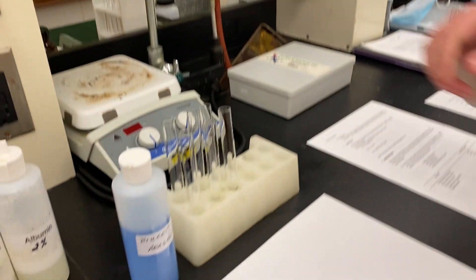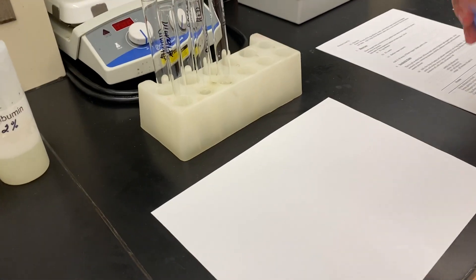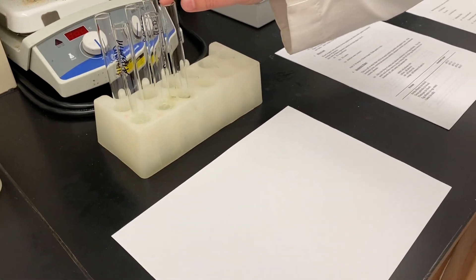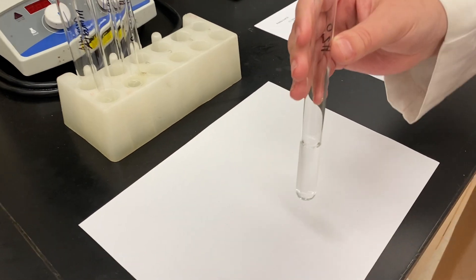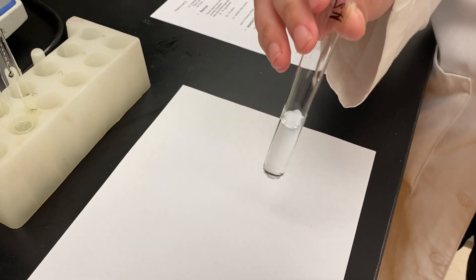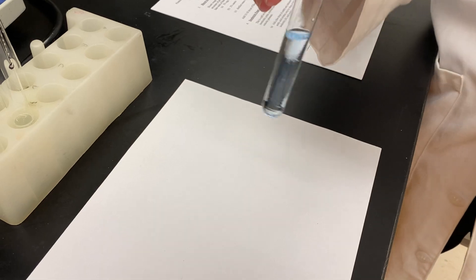What we'll do is we'll first start with water to take a look at the control group. We have two test tubes of water here. We're going to add, it says in your lab report, 15 to 18 drops. We're just going to do a nice squeeze. Eyeballing.